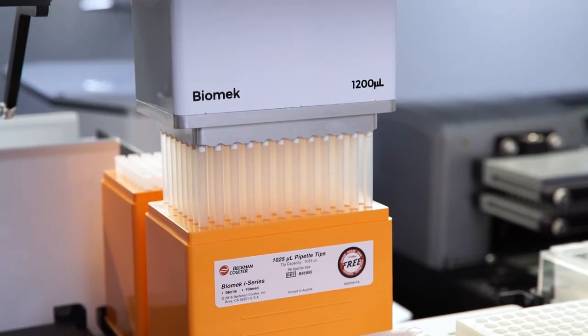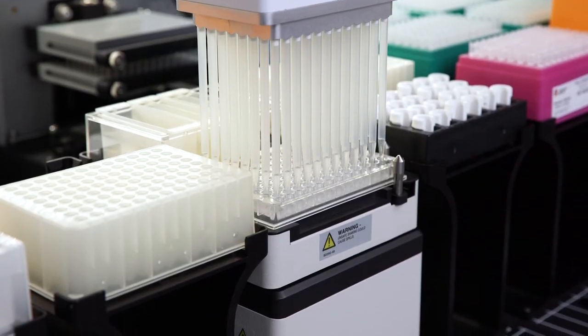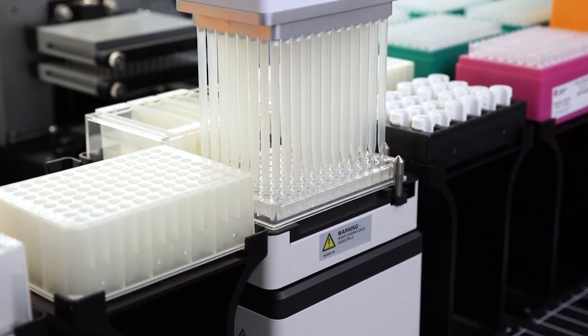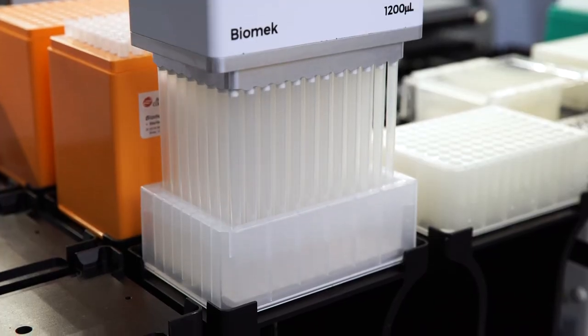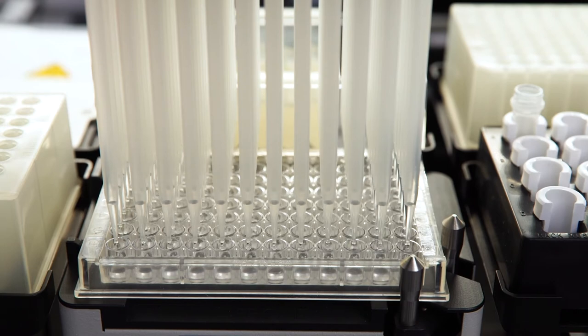Biomech liquid handlers come with a 1200 microliters multi-channel 96 head for large volume transfer, significantly reducing the processing time. The large capacity 1000 microliters tips on the multi-channel head can be used for the washing steps in your ELISA.